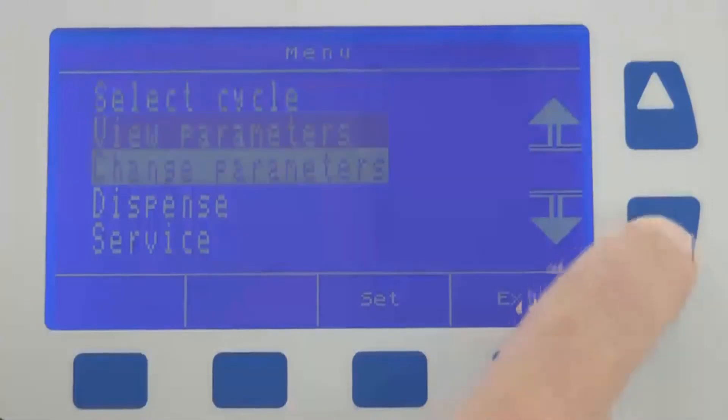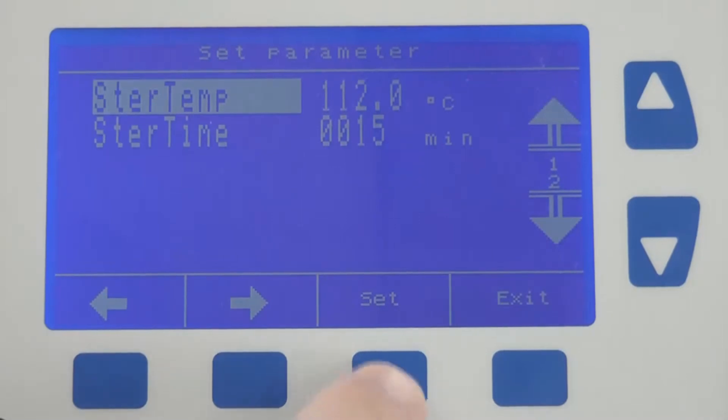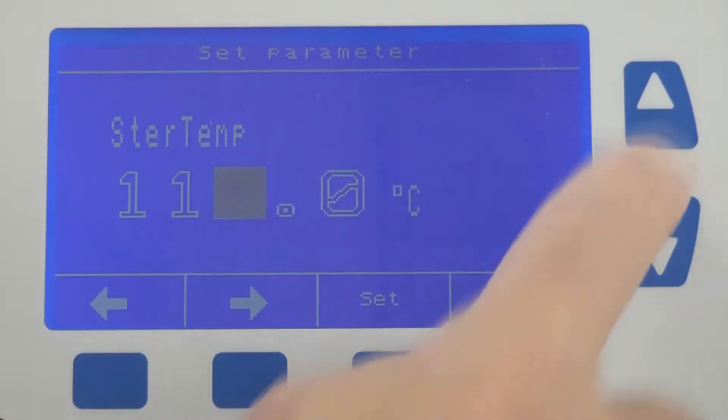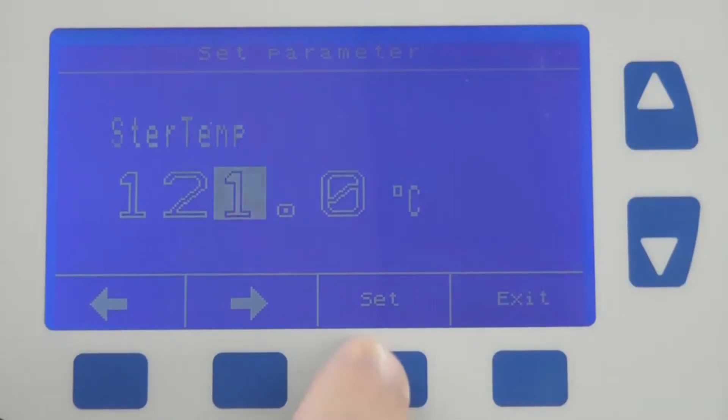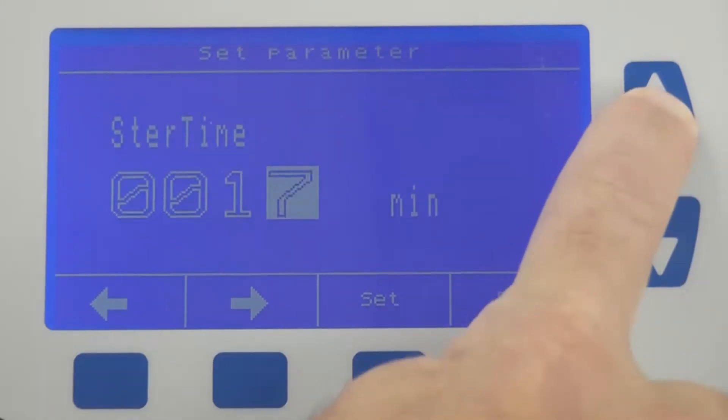Programming the media prep system is very straightforward. After entering an access code, simply select the parameter you wish to change. In this case, we are going to change sterilization temperature from 112 degrees Celsius to 121 degrees Celsius, and sterilization time from 15 minutes to 20 minutes.